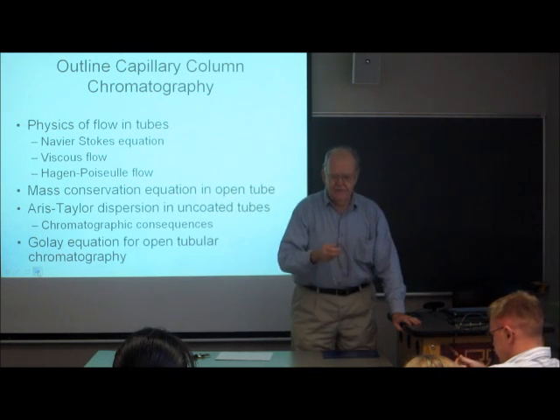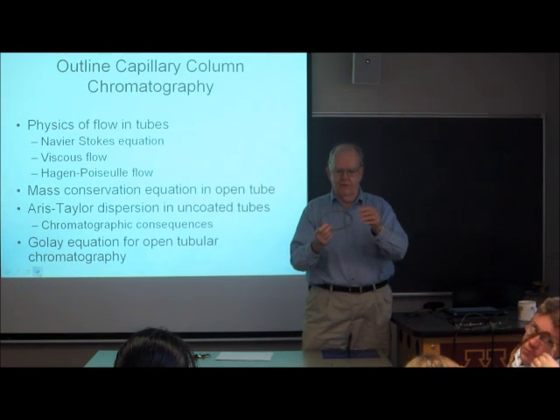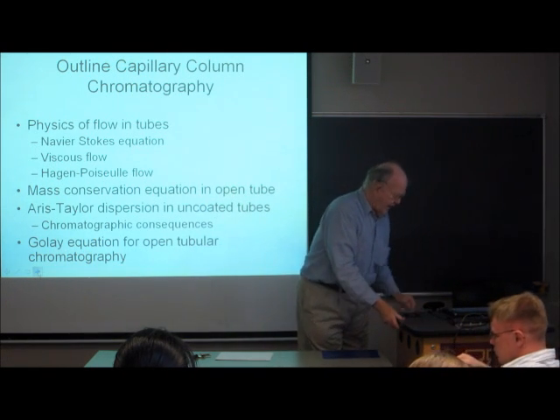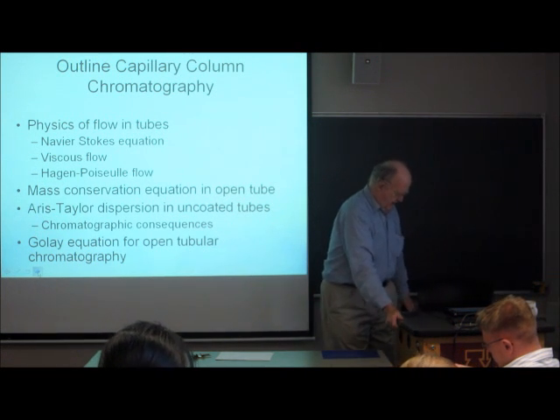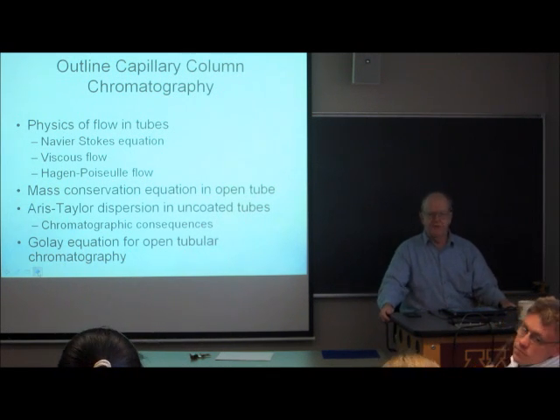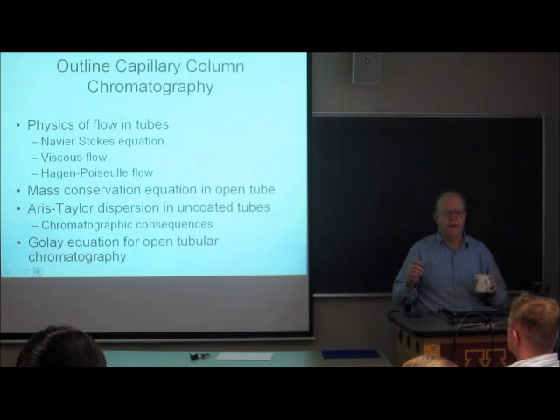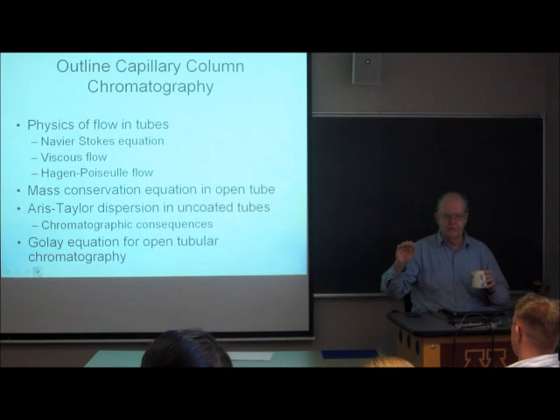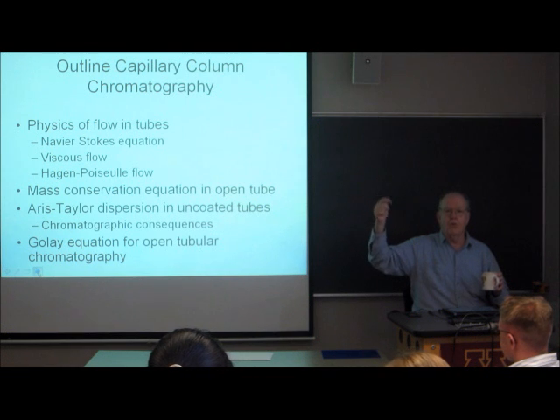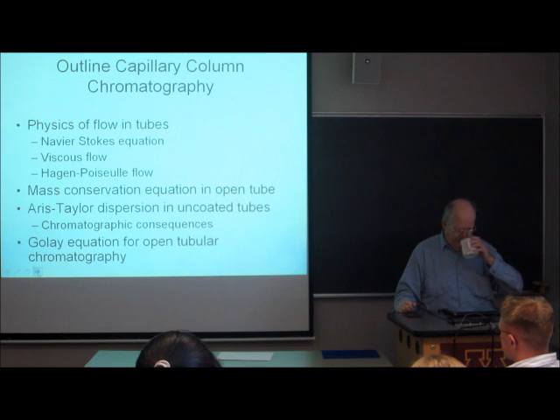This is a little bit wider diameter capillary than that one, and it's been deliberately broken so that we could look at the end of it and see what it looks like. The brown stuff on the outside is a polymer coating, which makes the fused silica a little bit more mechanically stable. But you don't do the chromatography on the outside of the tube, you do it on the inside of the tube. And the stationary phase is on the wall of the inside of the fused silica capillary. I'll show you a diagram in a second.